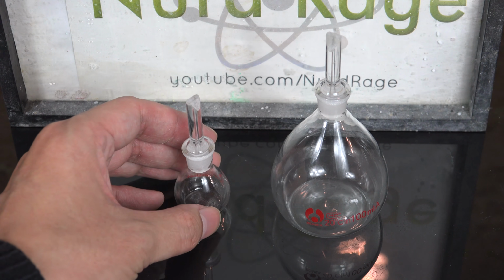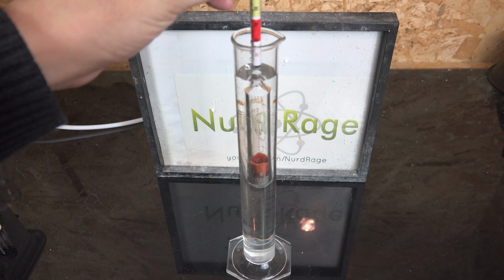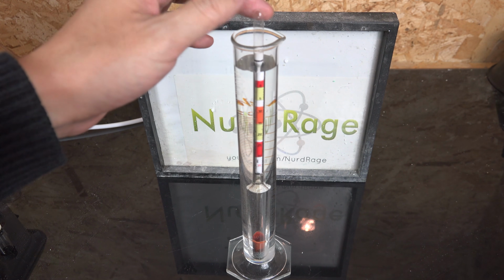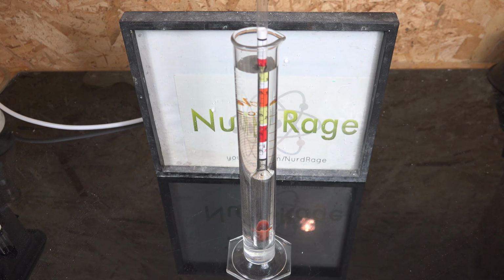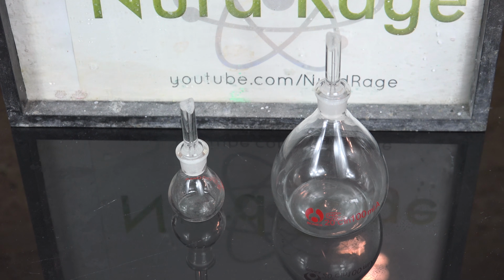Okay, so that was the various ways to measure density. I know it's not as cool as other parts of chemistry, but measuring density is a useful way to characterize your products. For things like monitoring chlorate cells or nitric acid concentrations, the quality of information you get out for the minimal effort you put in is extremely efficient.